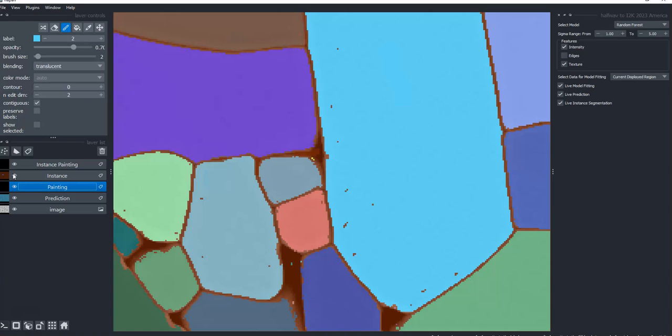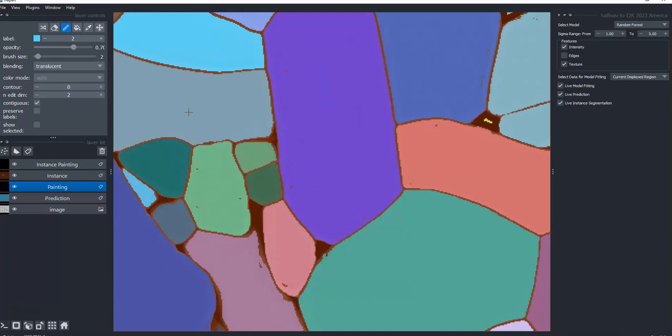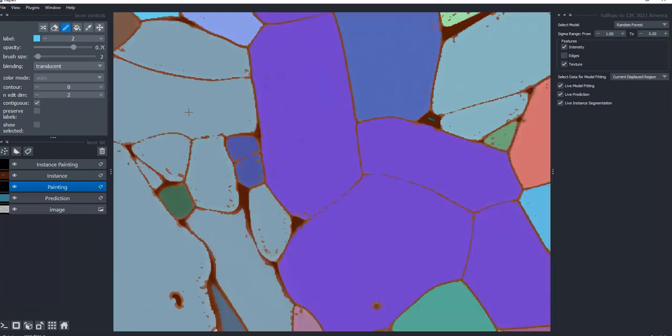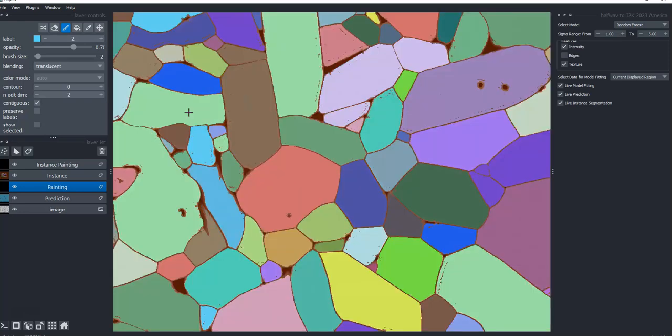So you can get a good idea of how these boundaries are actually separating objects. So what you're looking at here is machine learning. It's learning how to separate pixels into background and foreground, then doing an instance segmentation, or a labeling, so you know whether the boundaries are continuous enough to actually separate your objects.